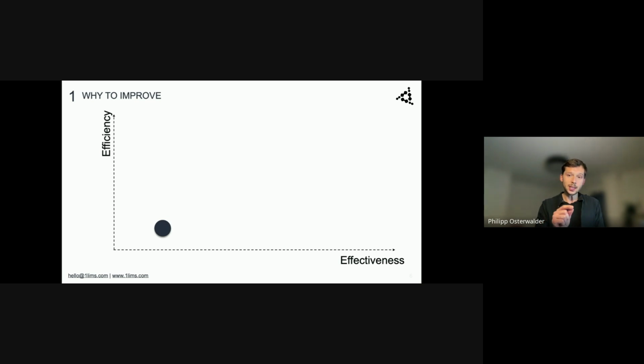This is the key question to find out which workflows bring the most value and which workflows need the most time. That means the most added-value workflows should be taken into consideration, and the routine workflows, the donkey work, which just brings paperwork or copy and paste work, is just pure effort, but not that much added value to the laboratory or the company itself.